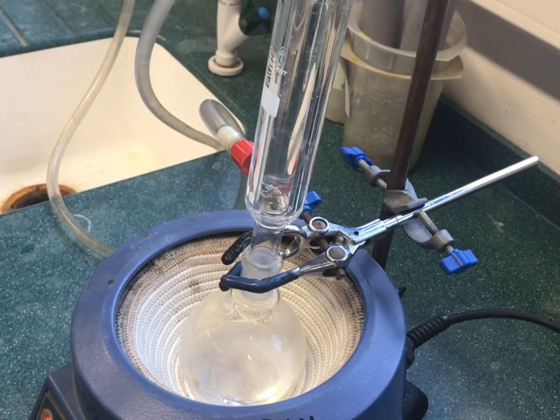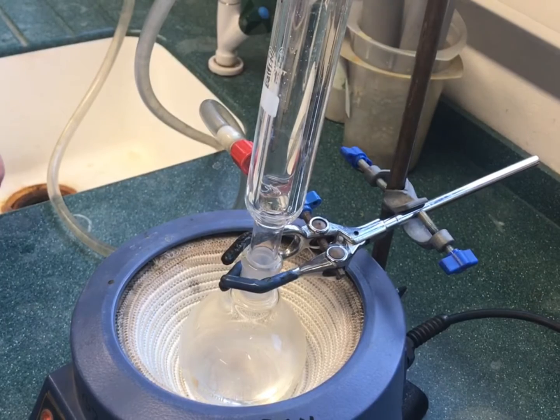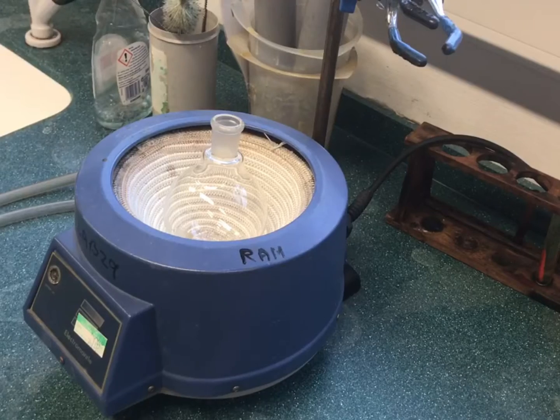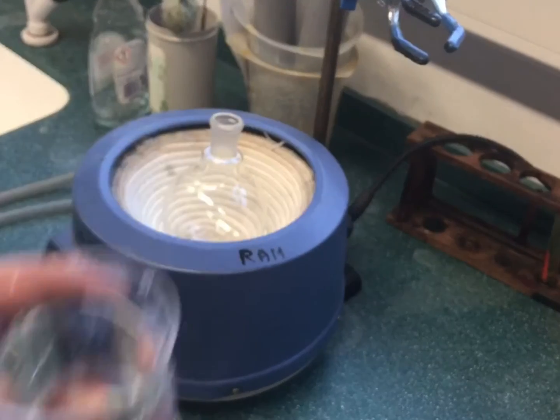Heating under reflux is required when a reaction requires continual heating for an extended period of time to occur. Refluxing allows the reaction mixture to be heated without loss of reagent through boiling. Gases produced are condensed back into the reaction mixture.